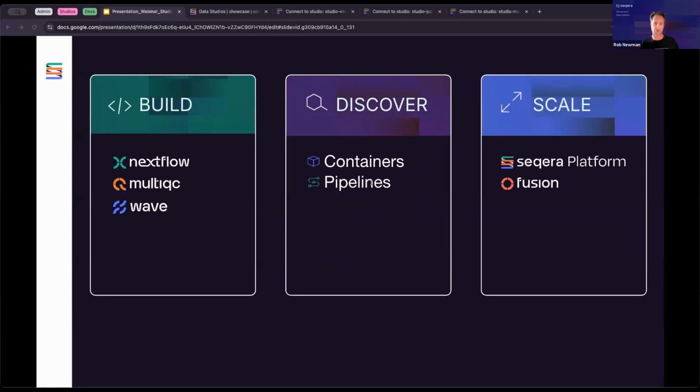The second pillar is nurturing an open science community. So we not only want the tools to exist, we also want to share the world-class resources and enable scientists to discover and learn from each other. This is through things like Seqera Pipelines, where you can find off-the-shelf ready-to-use pipelines, or finding Seqerans as very active members in our online communities like Nextflow, nf-core, and Seqera's own online community forum.